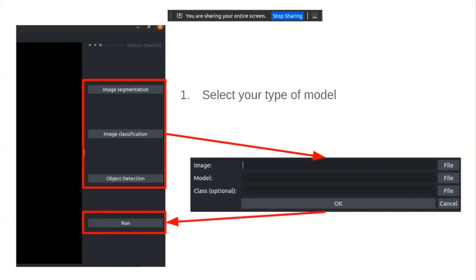Manini plugin has four buttons. The first button is to import your model, your image, and your class. The second is a run button where you run the inference of your model and image.